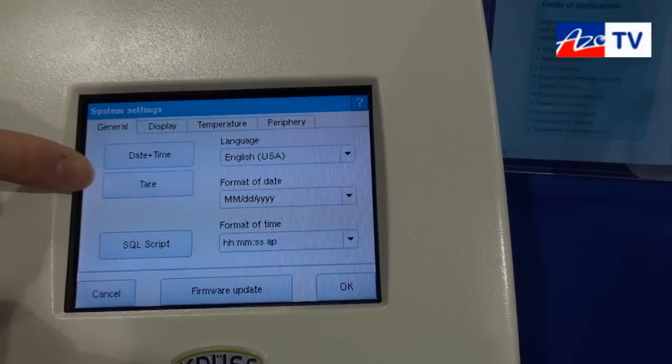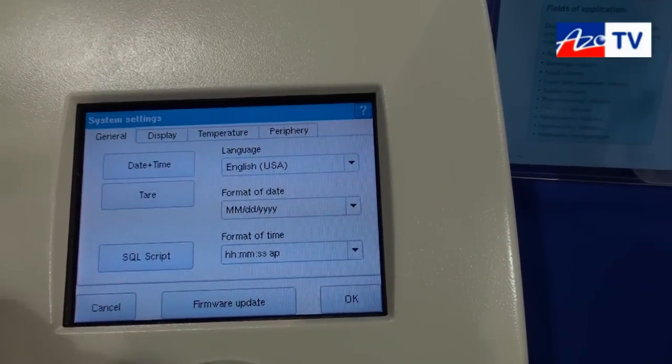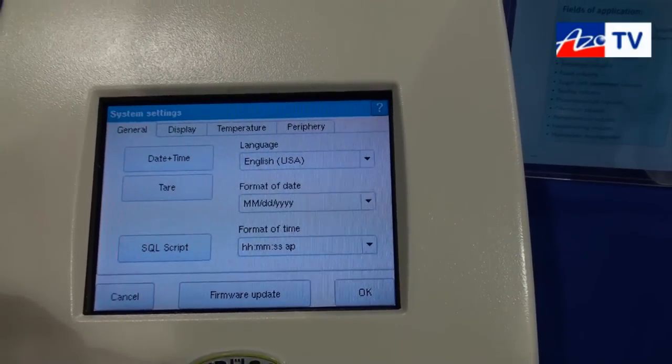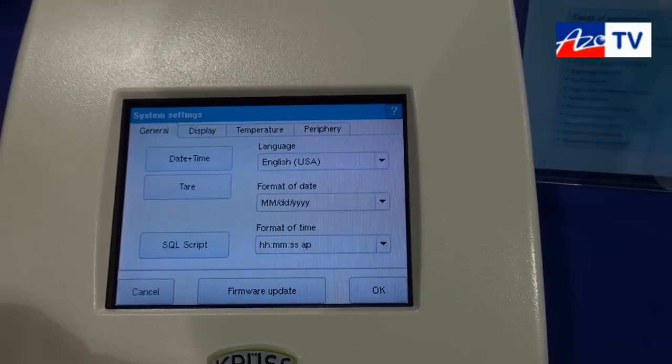The calibration is here — this is the zero. It's very easy to use with calibration liquid or with water. Firmware updates are also possible. You can do it with a USB stick — put it directly in the instrument and load the new software onto it.